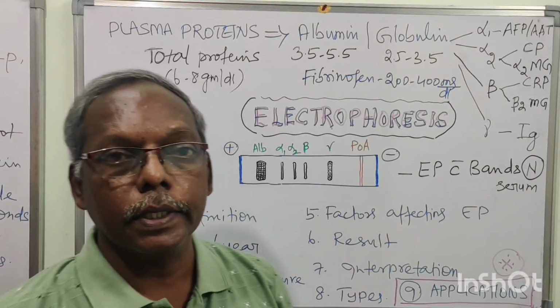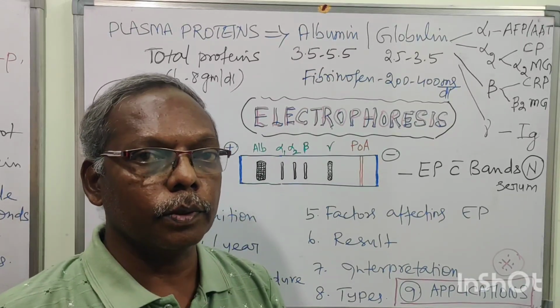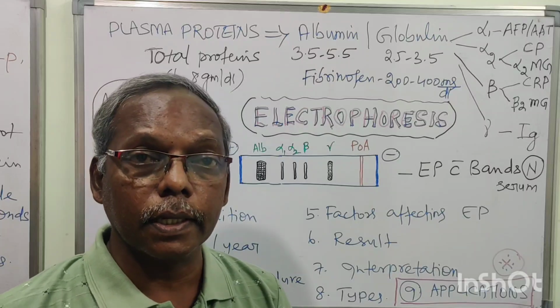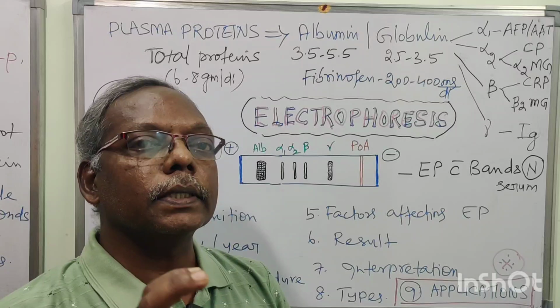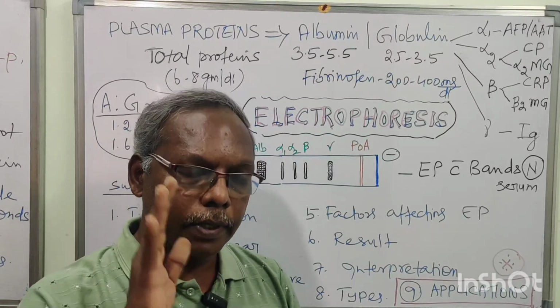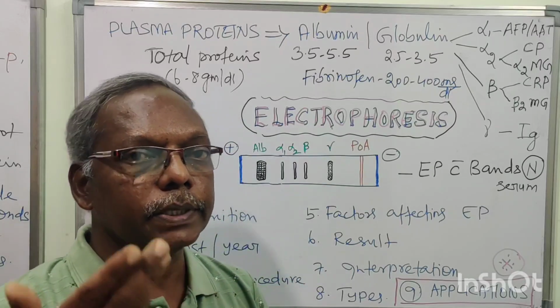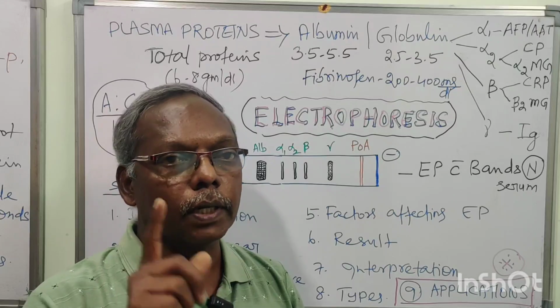Yes, today we are going to see another 5 mark short notes for either paper 1 or paper 2, because this is coming under either plasma protein metabolism question, or sometimes it is coming under instrumentation like electrophoresis, right? So this electrophoresis, what are all the subtitles? First you should know about the subtitles for this, because it is a definite 5 mark question, no essay question. So you should write minimum points for the electrophoresis, because it is actually a PG question, MD Biochemistry PG question, but you should know the basics or outline of electrophoresis.